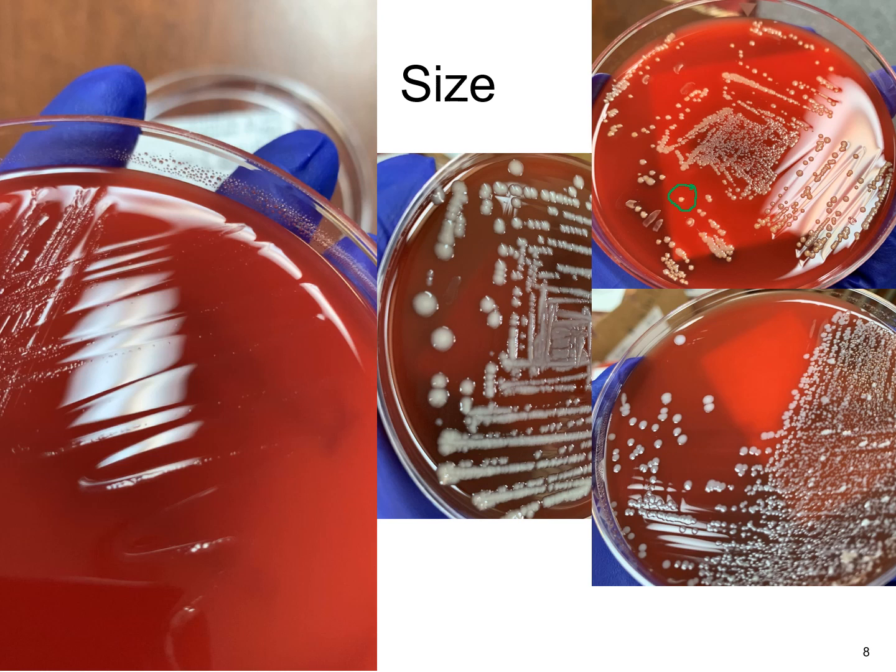You're looking at them as individual colonies, not grouped together like in the center. This second plate, they're a little bit larger, so these would be more of a medium-sized colony. And again, when they're growing side by side they look small, but once you get them out to themselves, they're a little bit bigger.